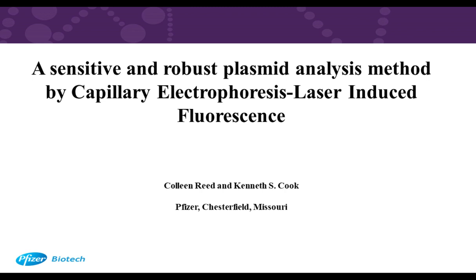might not be flat. They might kind of have a smile look to them, actually. And this causes issues with the actual quantitation of the bands themselves. And then this issue with the bands leads to less reproducibility with that method. And then also, if you get a thick band, like something that you might get with a high sample amount in your agarose gel, the migration time tends to go a little bit faster than normal, and this causes variations between the gels as well. So although agarose gel is less sensitive and less quantitative than the CE method, it's a good tool for us to use with our CE data to confirm our work on the CE.